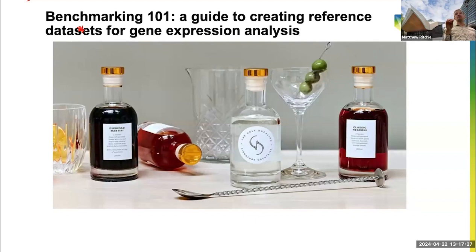So for those sorts of setups, basically every gene can change at different levels depending on their abundance in the different pure samples. And then hopefully you can read it across the mixture series. And hopefully the method will quantify that change in expression really accurately for you.